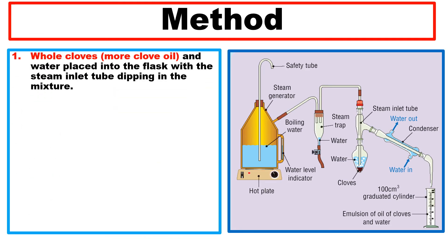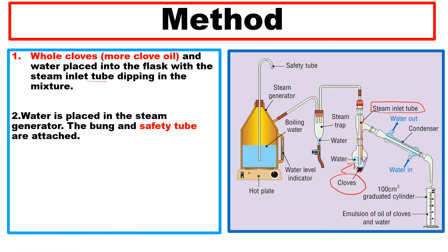Method step one: whole cloves and water are placed into the round-bottom flask, with the steam inlet tube dipping into the mixture below the water level. Water is placed in the steam generator and the bung and safety tube are attached.